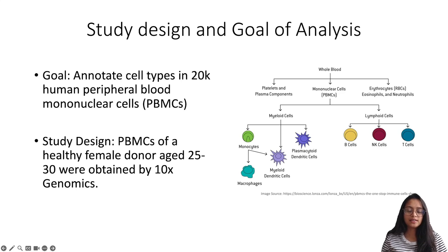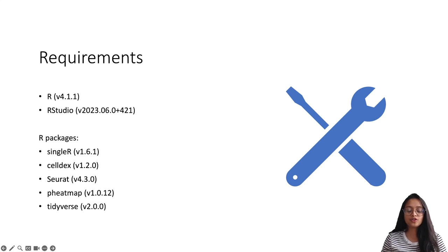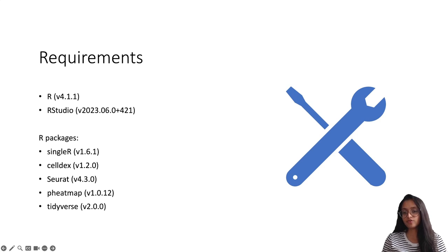We will be using the same dataset from the previous video — the goal is to annotate 20,000 peripheral blood mononuclear cells from a healthy female donor. In this demonstration I will be using two reference datasets instead of one to annotate these cell types. The requirements for today are these packages: SingleR to perform cell type annotation, celldex which provides reference datasets including many single cell atlas datasets, Seurat for preprocessing steps for single cell RNA sequencing data, pheatmap to visualize heat maps, and tidyverse to wrangle the data.